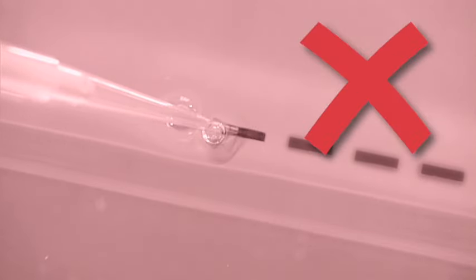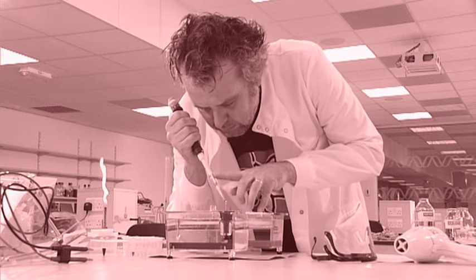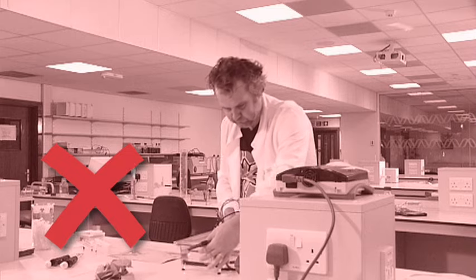Make sure you don't load air into the wells along with your samples. Air can cause samples to be lost from the well into the buffer solution and can also cause contamination of neighbouring wells. Another mistake when loading a gel is loading the sample too quickly — this will also cause the sample to flow out of the well. Once you've loaded your samples, take care not to move the gel, as even a small movement can cause sample loss and contamination.